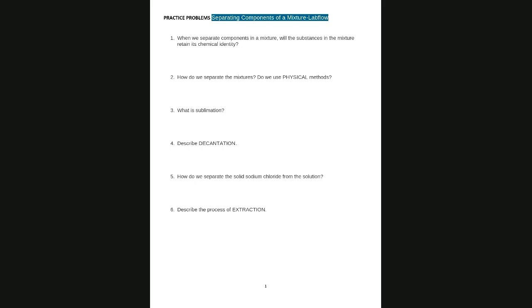Describe decantation. Do we know what decantation is?